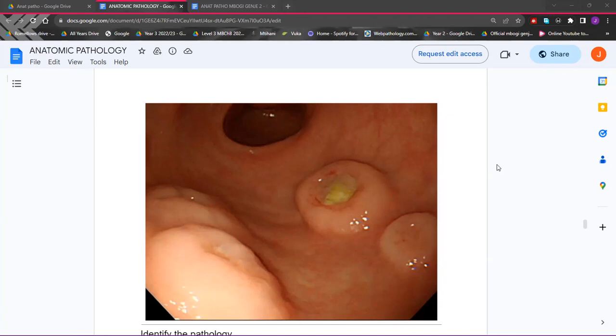Now, maybe I can try to guide us. Are they large or are they small? These lesions, they look large, right? Now, are they patches? Are they nodules? Are they macules? Are they papules? Maybe nodules. Yeah, they're sort of nodular or polypoid, right? Now, do they look solid? Are they well circumscribed? Do they extend to the adjacent tissue? Do they form ulcers? Is there any cavitation? Do they appear cystic? Is there some purulence inside? Maybe those are some of the guiding questions we can ask ourselves and use those terms to describe.